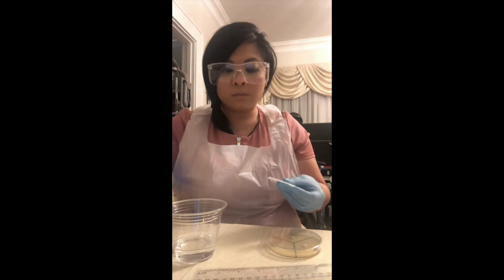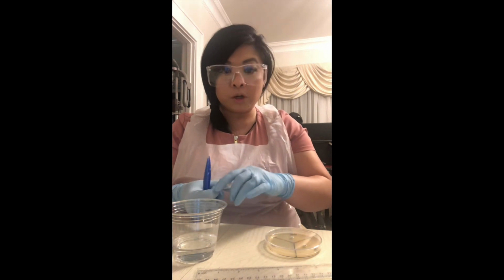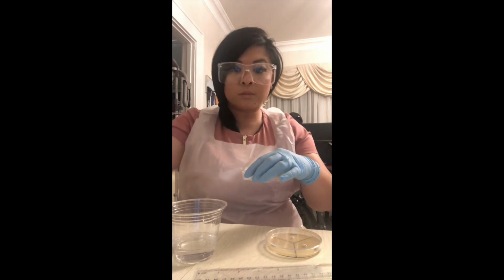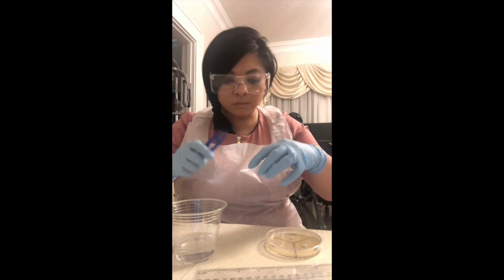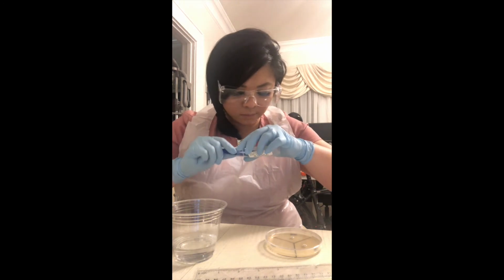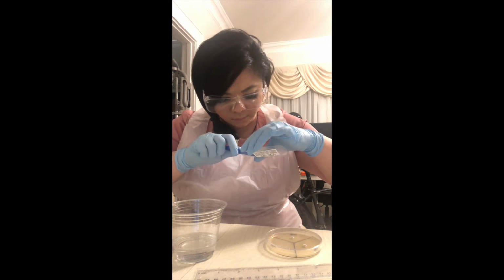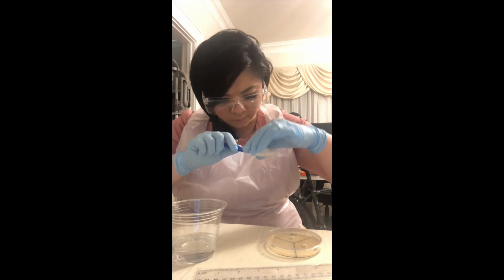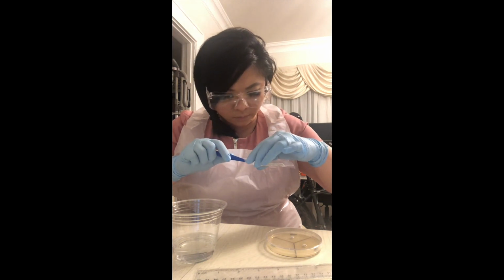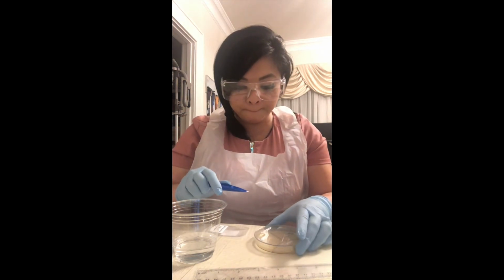And with the tweezers, I'm going to go ahead and collect the disc.